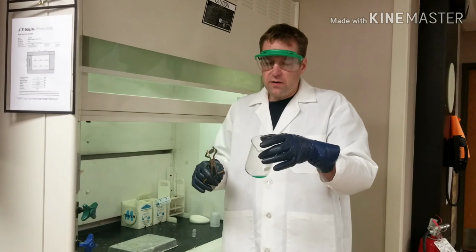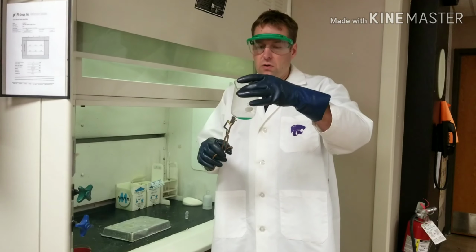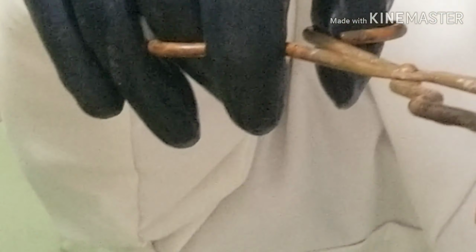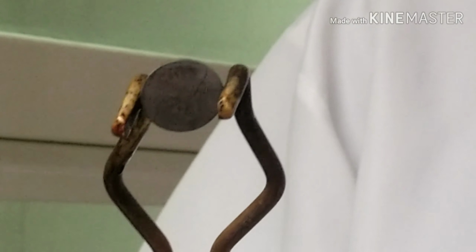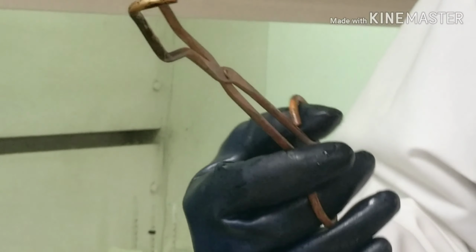All right, a few minutes later, we can see certainly the blue solution. So we know there's copper ions. And here's our penny, which we're basically down to the zinc disc. It's very, very thin. It may be hard for you to pick that up on camera. The penny has certainly lost quite a bit of mass here. That elemental copper is now copper nitrate, copper with a nitrate as well. Maybe a little bit of copper left. But there is our reaction with copper and nitric acid.